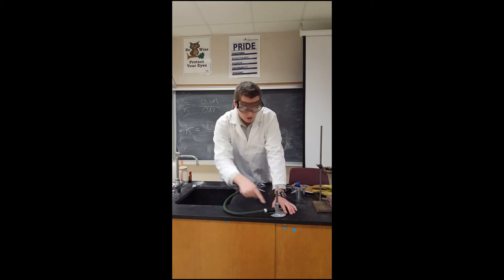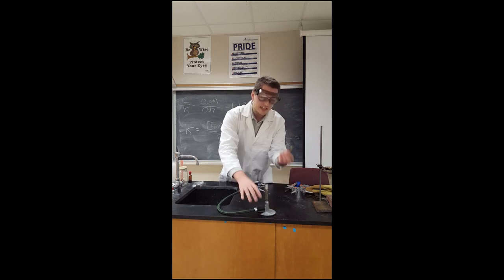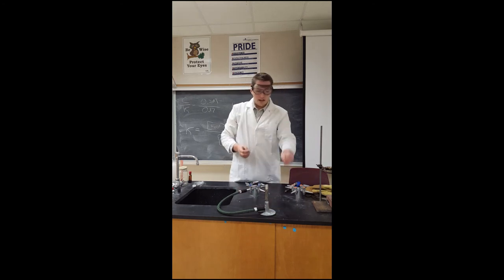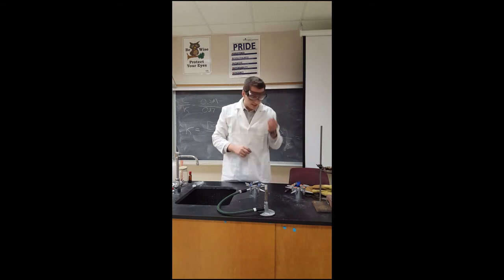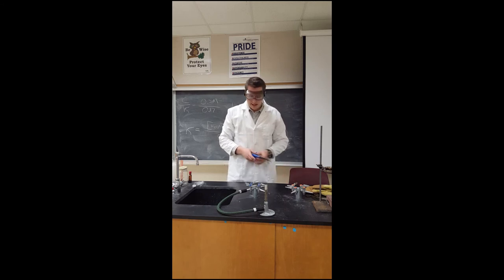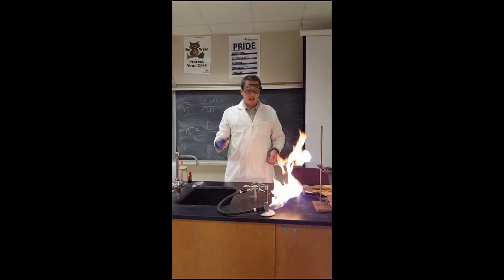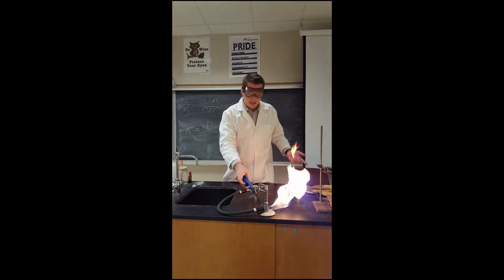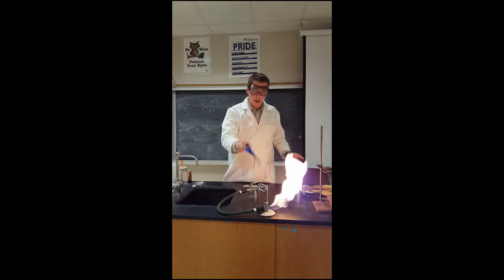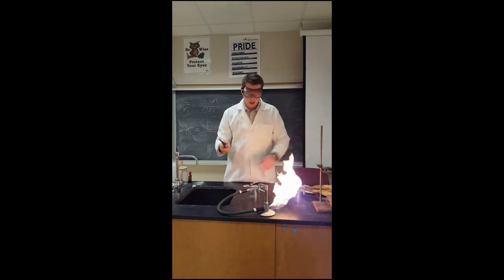What we also don't want to do is use a Bunsen burner that doesn't have its barrel insert, or if it's really loose and falls out, or if we just take it out thinking we don't need it. If the barrel is removed, the gas is going to take the path of least resistance — why would it go all the way up through the burner when it can just come out right there? Everything catches fire. So we're not going to do that. We need to put the barrel back in.